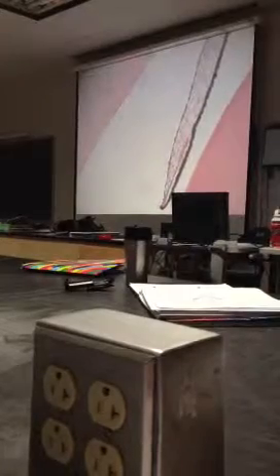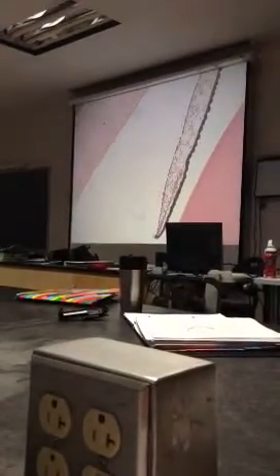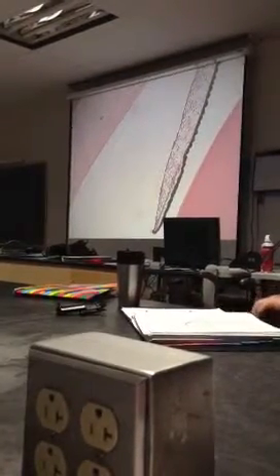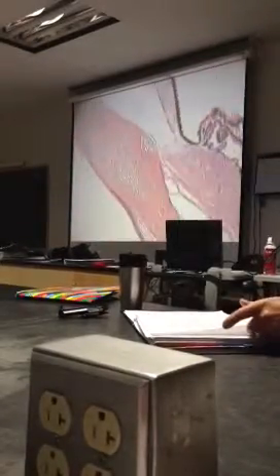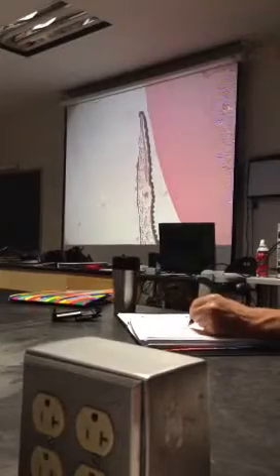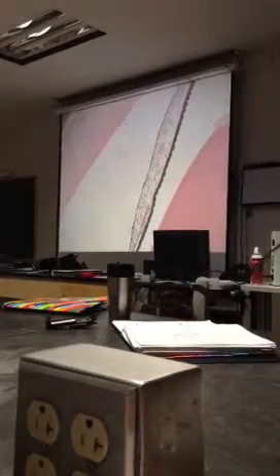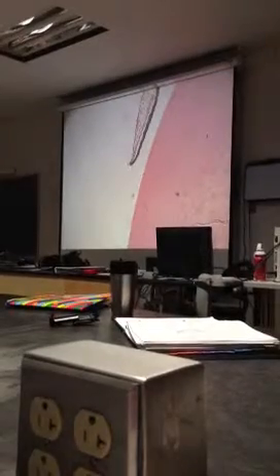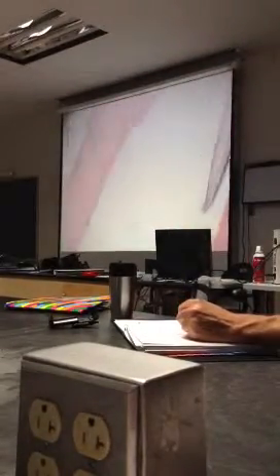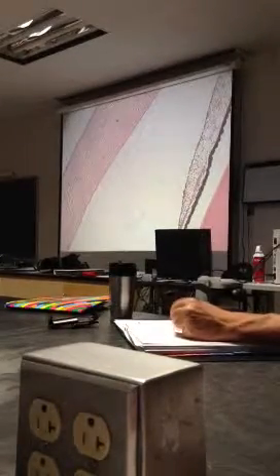And how about this? It stops in the middle and continues on the other side — that's the iris. This is the iris. It's not super well-stained, but there is smooth muscle in there, and you can see the brown pigmentation, the pigmented cells. And then there's this space in between where there's no iris — what's that hole? The pupil. That's the pupil. What fluid is in the anterior cavity? The aqueous humor — good, aqueous humor is in the anterior cavity.